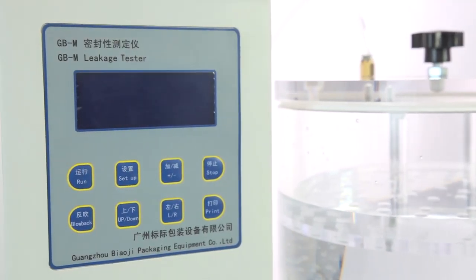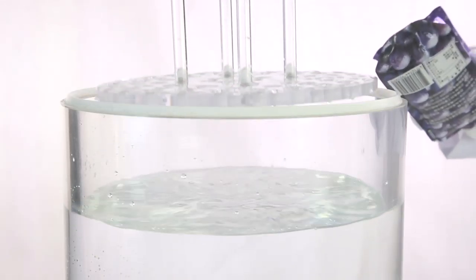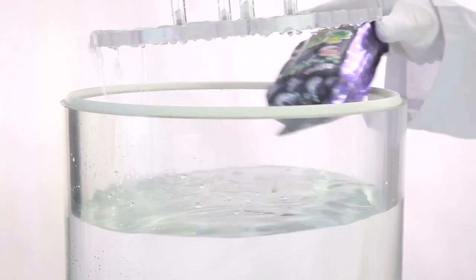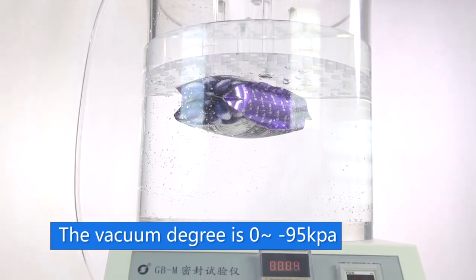GBM and GBM1 leakage tester are designed conforming to ASTM D3078 standard. The vacuum degree is 0 to negative 95 kPa.